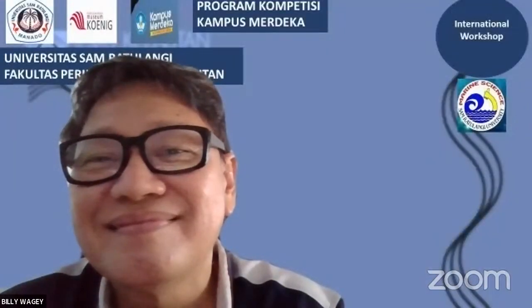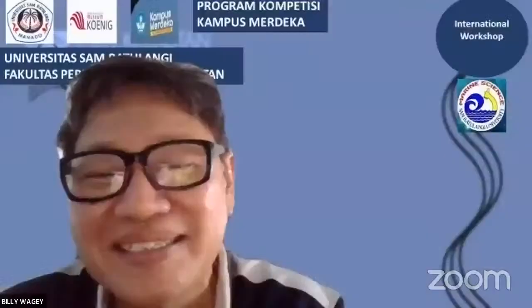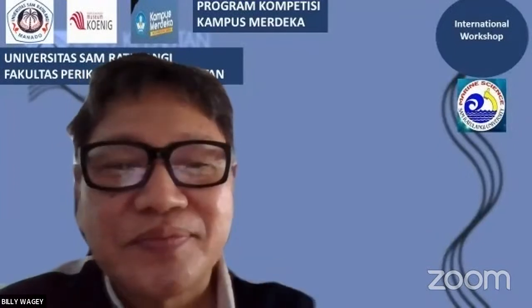And yesterday we did it, and we ended up with 280 sequences, I think. Wow. But then it started already with the first mistakes I made. Sorry, not James and Mehdi. CO1 is not working as a keyword for searching, so we used, as I usually do, cytochrome.